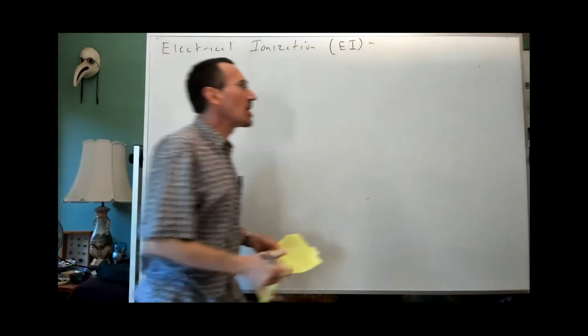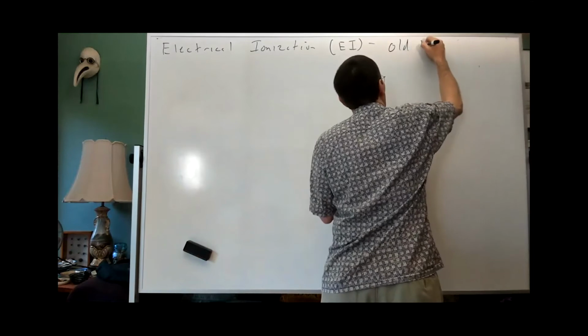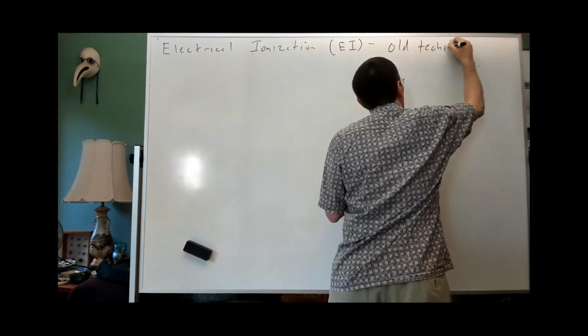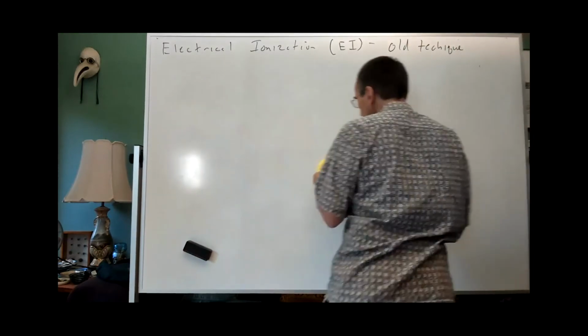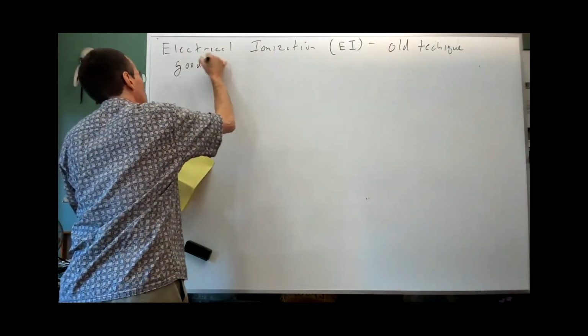And I'm going to describe it as an old technique, and maybe I'll say it's especially good for nonpolar molecules.